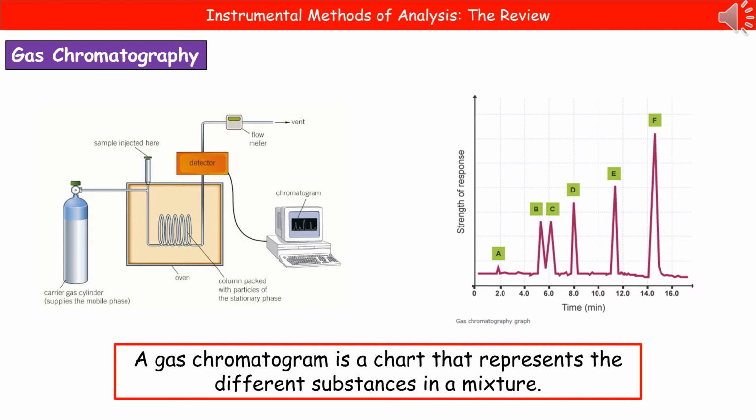In school, you've probably done chromatography using a bit of filter paper and putting a mark of a pen on there and then watching the colours run. This time, what we're actually going to do is we're going to change whatever our sample is into a gas and pass it through a bit of machinery in order to identify what we've got.